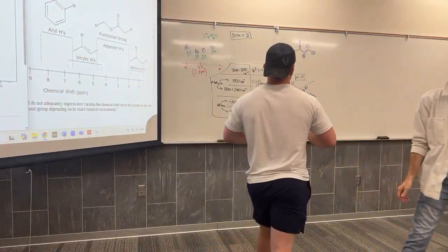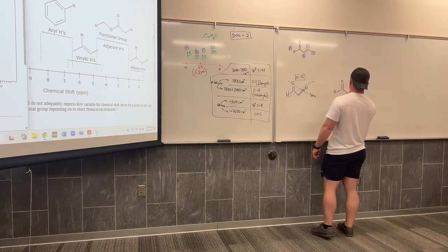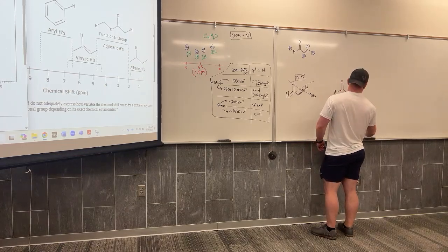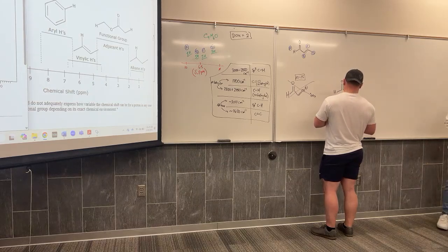How many correct answers are there for this? Maybe two minimum. I can think of at least 3 very distinct, up to like 8, 20. Not 8, I meant 20. So that double bond goes away, so it has a net positive charge. Where? Sure. And what is a molecular ion? It's also called a radical cation. So where's your radical? Would just have the other side where the bond was. Yes, good.